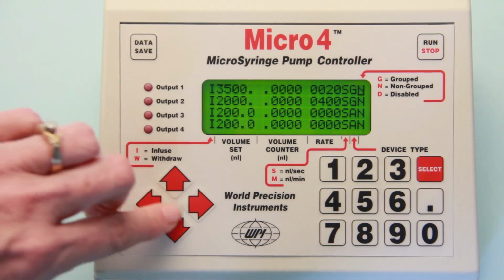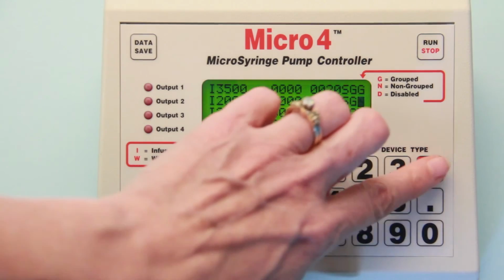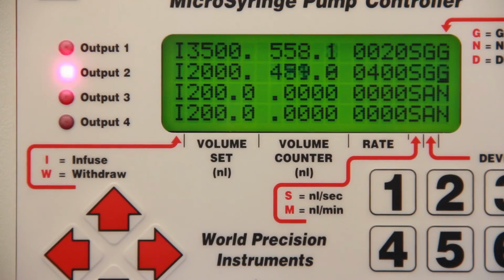To operate more than 1 pump at a time, cursor to the group field in the far right and use the Select button to change N for non-grouped to G, grouped. When you press Run, all grouped pumps will operate according to the settings of each channel.